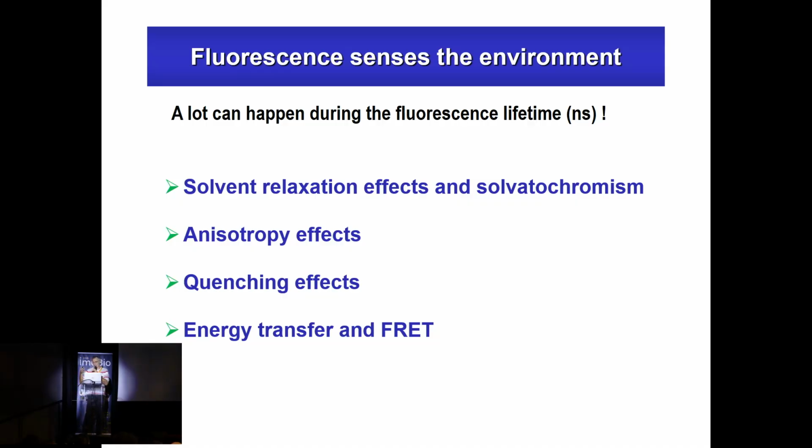So FRET is a kind of channel by which energy can be transferred to an acceptor molecule on a time scale which is equivalent to the lifetime of the donor molecule, so that these two actually compete with each other, and so FRET can be used in this way to measure distances at the nanoscale.